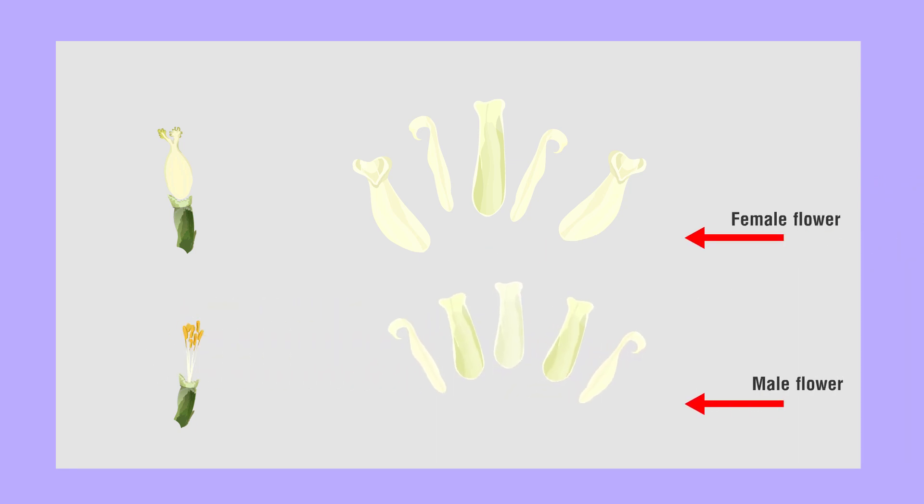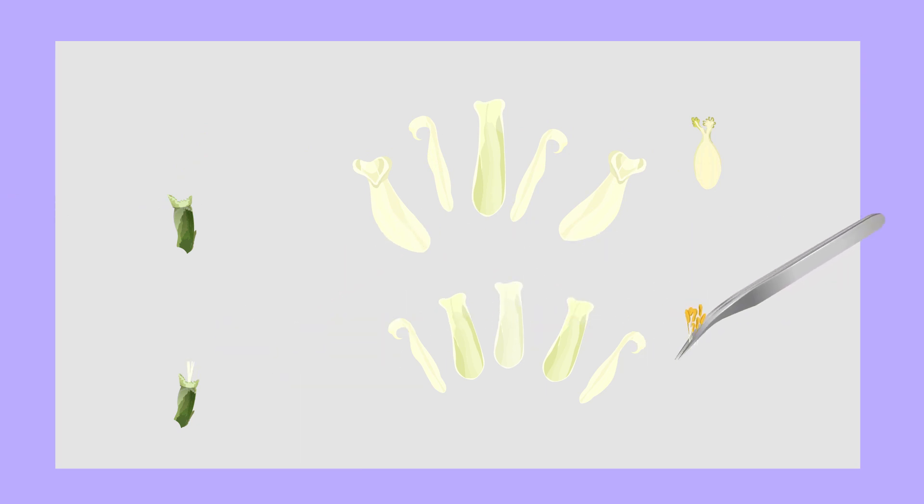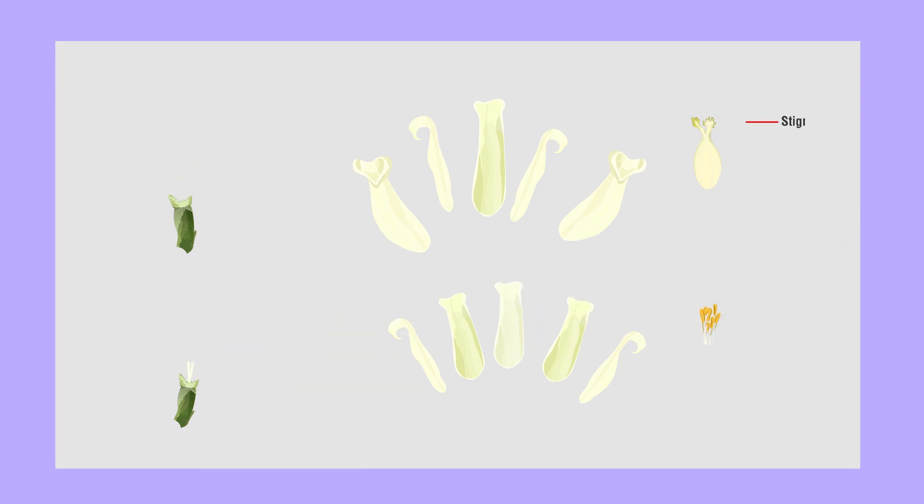Observe both the flowers. Using a blade, separate the male and female reproductive parts of the flower and keep them on paper. Observe and identify the parts of the papaya flower.